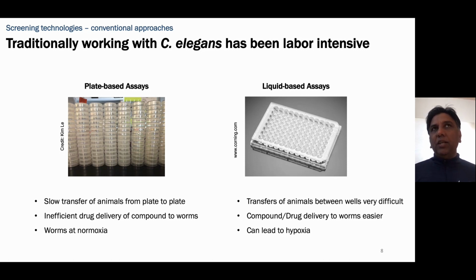However, the good thing is that the animals are living on the surface of agar. They're experiencing the ambient conditions, so oxygen and transport of gases is not a limitation when doing plate-based assays. On the right is probably the technology which is more typical of the drug discovery industry, if you will, where worms are loaded in these wells. But again, here, because of the reproductive phase, unless you use some special drugs to block reproduction, it really becomes limiting to do whole life. That means studying older animals and so on.